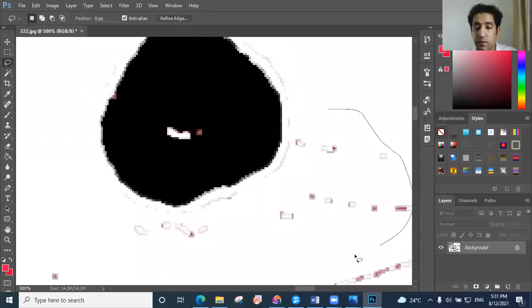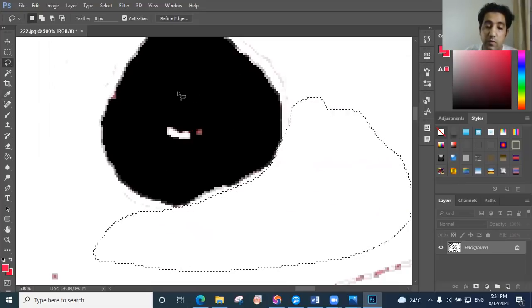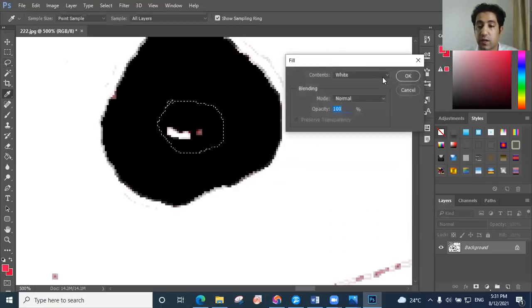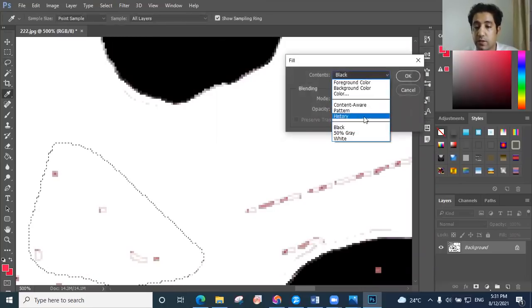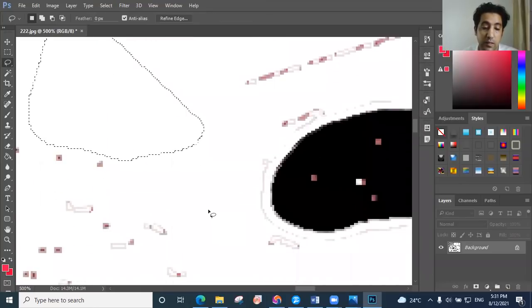You can see here, we will do everything here. And this white dot inside the grains, you can just cover and then delete and change the color to be black, and it will be black. And then just keep cleaning, change the color to be white, and then, all right.